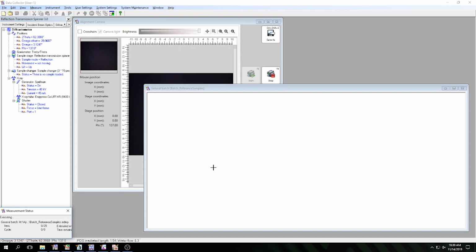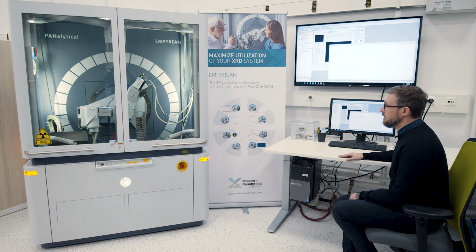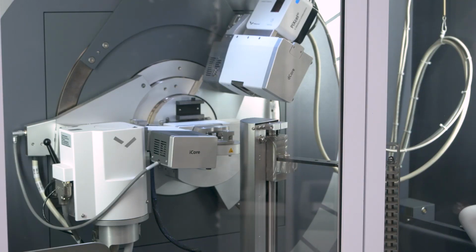With that, my work will be done for the next 45 to 50 minutes, during which all the data is being collected. As you will see now, in a couple of seconds, the samples will be loaded, like here for sample number 1.